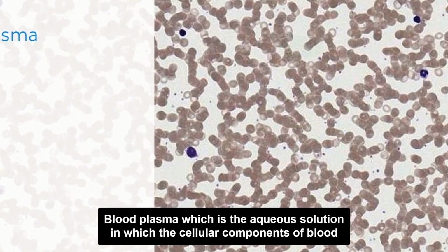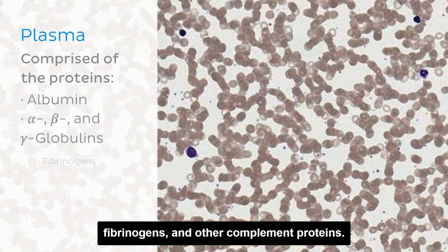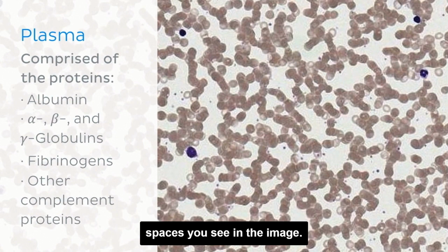Blood plasma, which is the aqueous solution in which the cellular components of blood are suspended, is itself comprised of the proteins albumin, alpha, beta, and gamma globulins, fibrinogens, and other complement proteins. In this slide, of course, the blood plasma is transparent and is therefore the white spaces you see in the image.